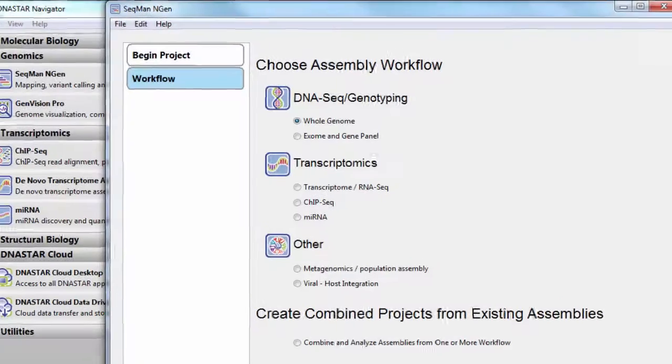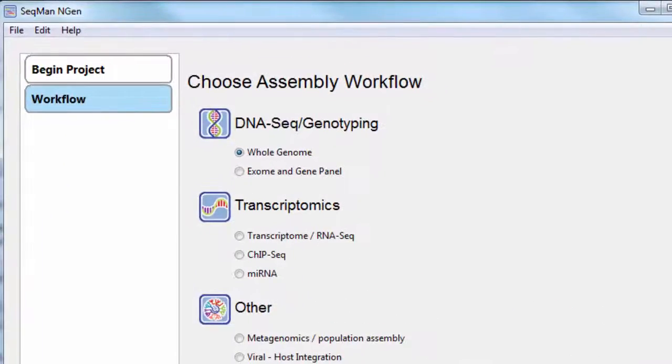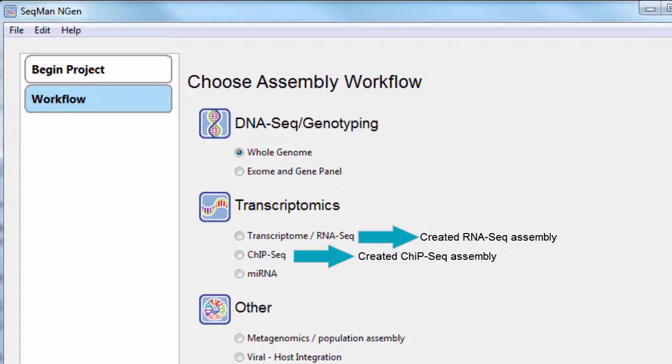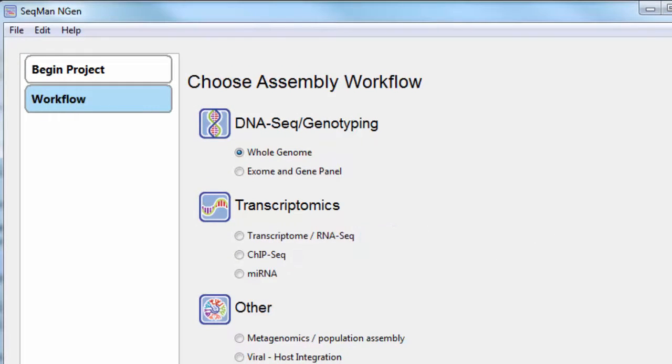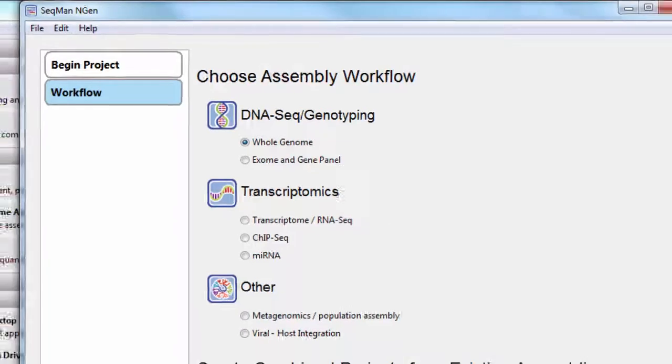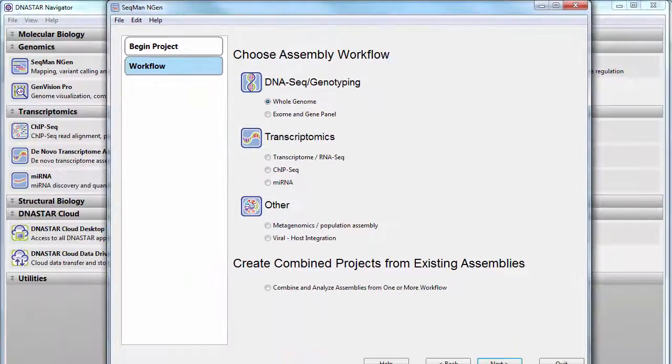To get started, you need to have already assembled the projects you want to combine. And it's important that the assemblies you want to combine all used the same reference genome.